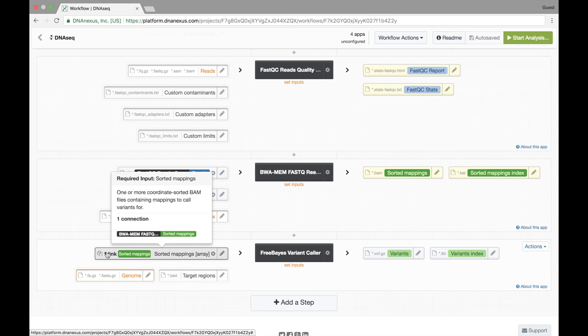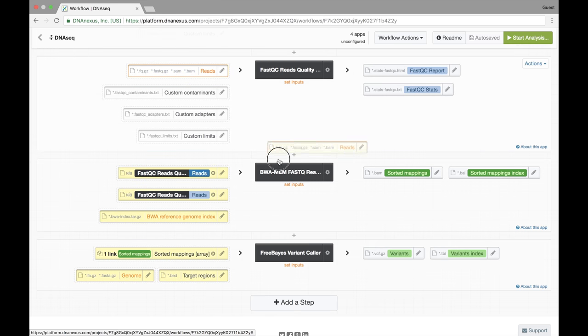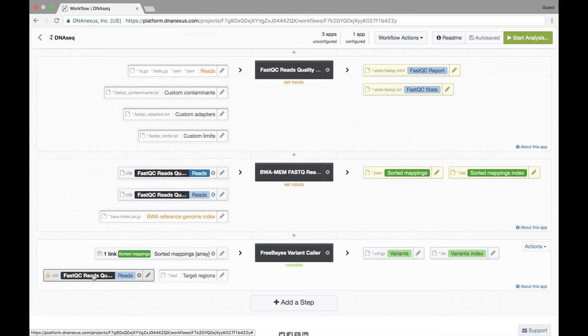So our workflow is complete now. However I want to point out a couple nice features of the workflow editor. If I were to drag and drop for example reads to an invalid input such as genome, it would flag me saying that the extension does not match.